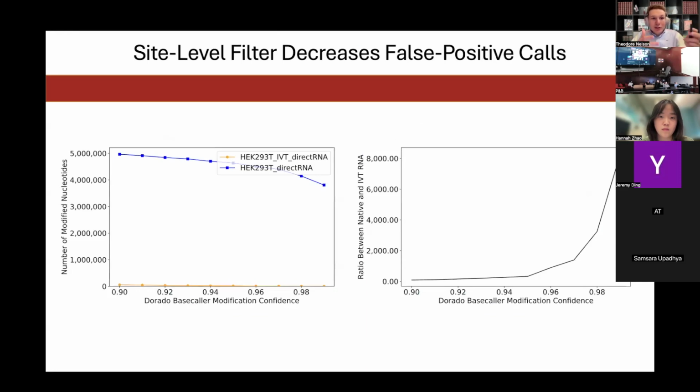And after lots of technical benchmarking, looking for samples, generating samples, sequencing, combining, we have a strategy and a filter that will allow us to broaden our horizons and do what is the promise of this, which is the beginning, or the middle, depending on how you look at it, of high-throughput epitranscriptomic calling.